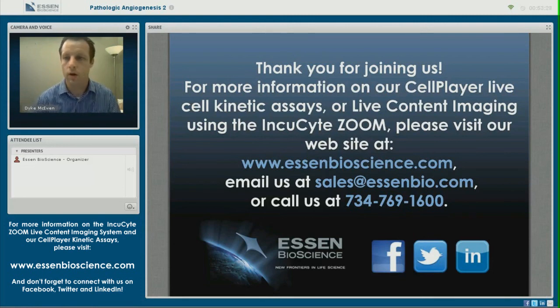There's another question about how the cells are derived. Our ADSCs are derived from adipose tissue that is separated during liposuction treatments. It's waste material from the liposuction that is spun down, and the adipose-derived stem cells are generated from areas that are in very close proximity to vascular beds within that tissue.